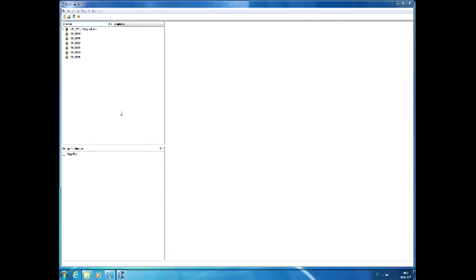Yeah, we're going to look into what you can tweak, what you should tweak, and what you should not tweak. Okay. And then, of course, the reconstruction happens, and once you have your reconstruction, based on the different atomic positions, you can do your analysis. Okay, so let's get started.